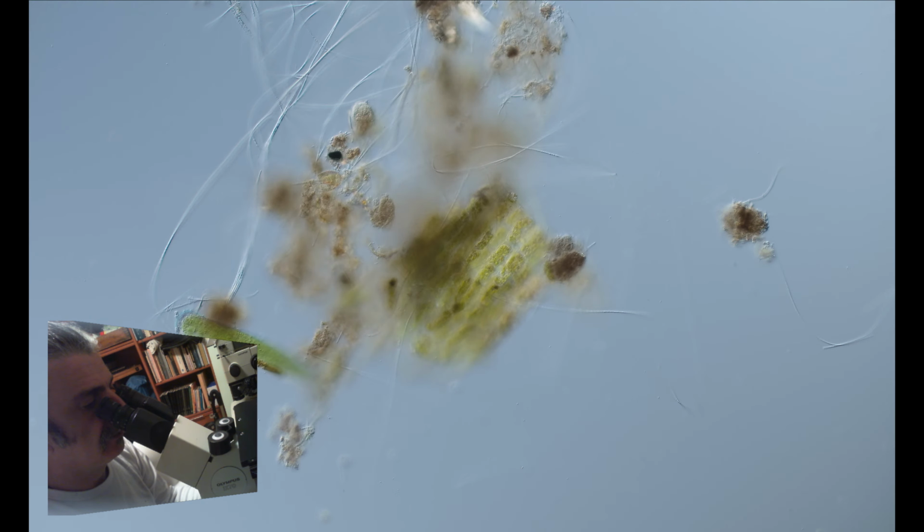What's nice about viewing a sample in a Petri dish is that we can see two neighborhoods actually. The bottom one, where the creatures like to crawl on the surface, and the top one, which we'll explore later, which contains other organisms that live on the biofilm of bacteria that floats around.